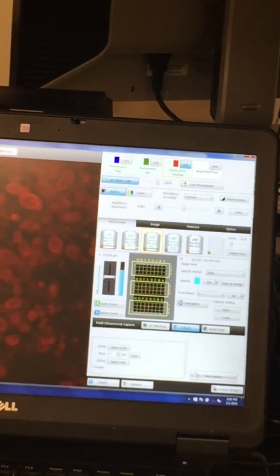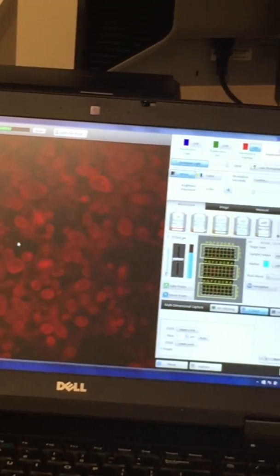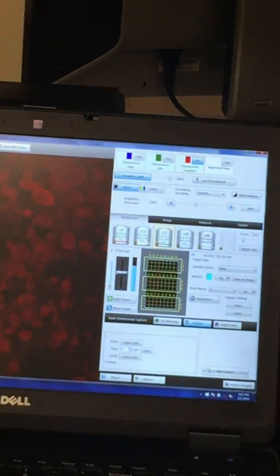So what you're going to do is scroll up. Imagine you're on a web page right now. To get to the top of the page, you push the wheel away from yourself. Same idea in the Z-plane here. So you go to the top and click upper limit. You can always tell because this is what your Z coordinate is, and it just copies it right here.